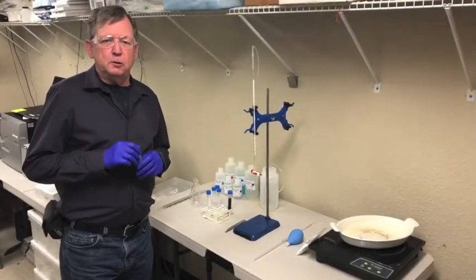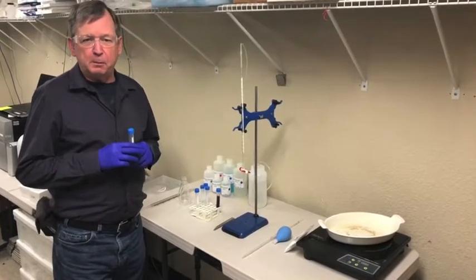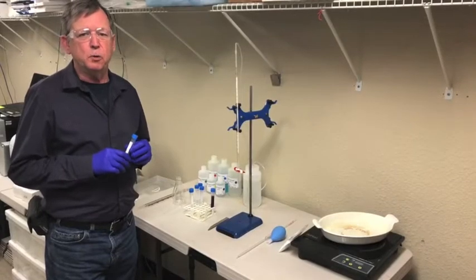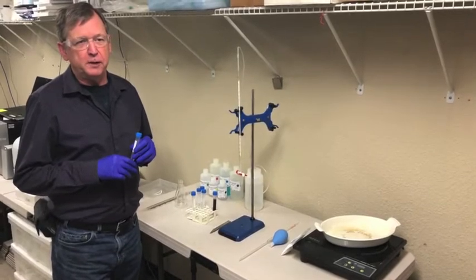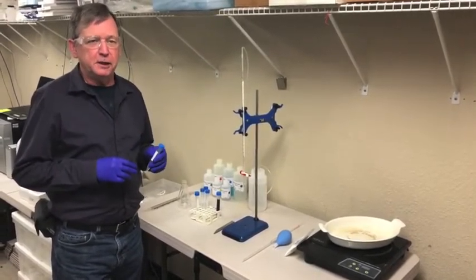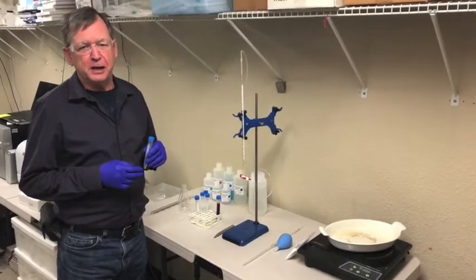The residual reducing sugar test relies on what's known as the Rebelline method, in which we are going to react the sugars in the wine sample with copper under alkaline conditions, and then do a titration to determine the amount of copper that was consumed. That will allow us to calculate the final concentration of sugar in the sample.